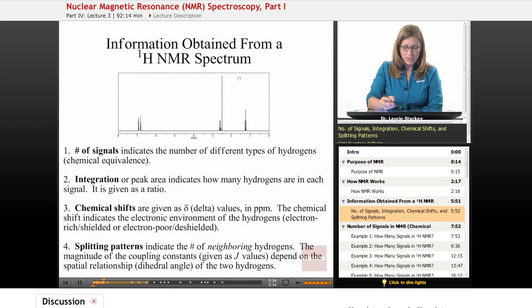So when we take a look at a spectrum, here's an example of a spectrum. There's a lot of information that's buried in here, and one by one, we're going to break these down and learn more about them. One of the things we're going to see is the number of signals. How many signals are there in the spectrum? Here are two signals, here's another one, here's another one, here's another one. So the number of signals that we have is going to tell us something about the different types of hydrogens in our structure.